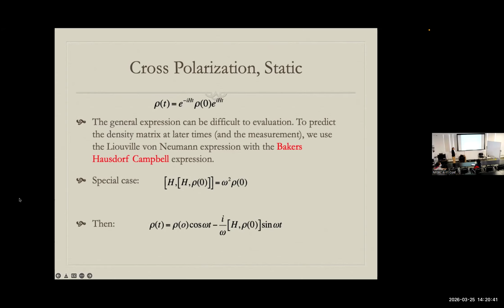So this is like oscillating between Ix and Iy under an Iz type operator. So you're in a special space where there's only three things: where you started, what you're going to evolve to, and the Hamiltonian itself, and they operate cyclically. So if you want to know if your problem is that easy, you take your initial density matrix, you take two commutators with H naught, and you say, oh, this is dead easy. This is just like Ix, Iy, Iz.